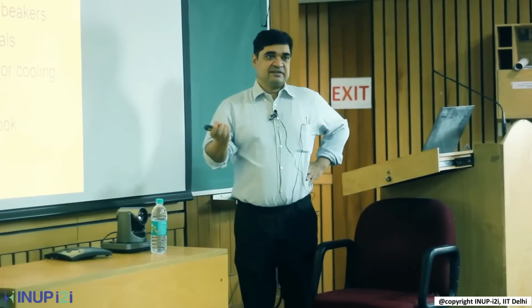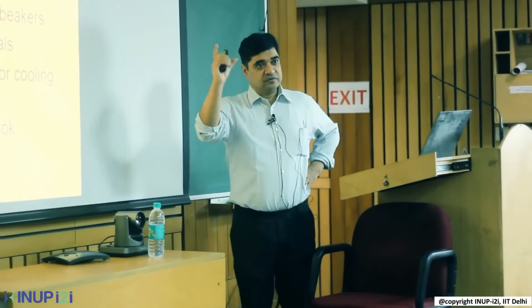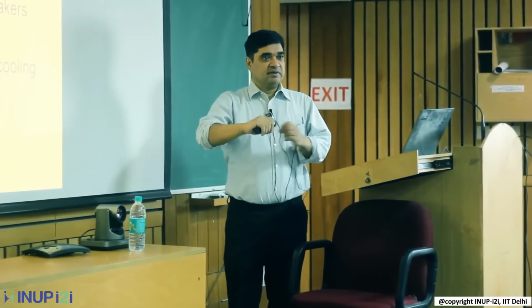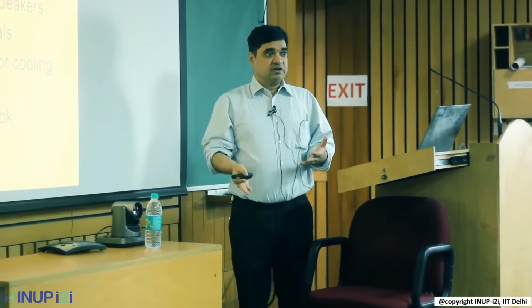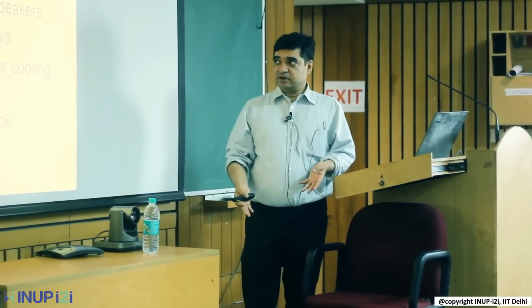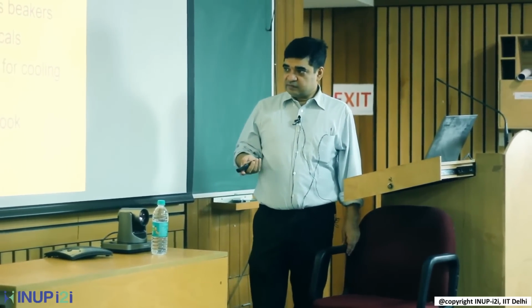we don't exchange glassware. Whatever is used for HF, we use for HF. Whatever is being used for acetone, we use for acetone. You don't take one beaker from the solvent bench and use it at the acid bench. You don't borrow beakers. If you're short of beakers, ask clean room staff and they will provide you more beakers, right? So I think this is fine.